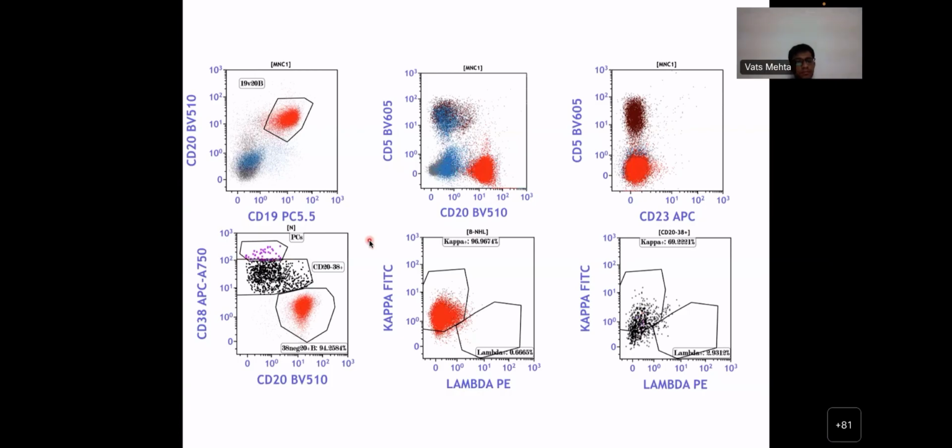What are markers for plasma cells? CD38 and CD138. Yes. So if we are thinking of multiple myeloma, those would be CD38 and CD138 positive. But the predominant population here is actually CD38 negative with a maturation trend going towards CD38 positivity and going towards plasma cells.